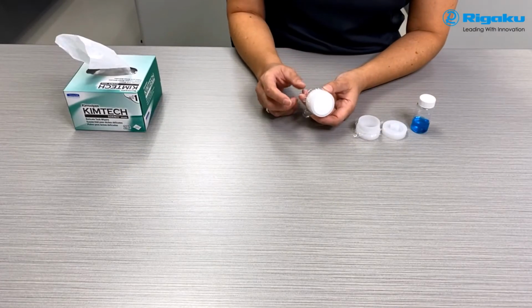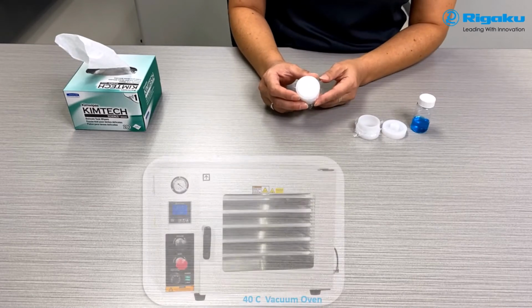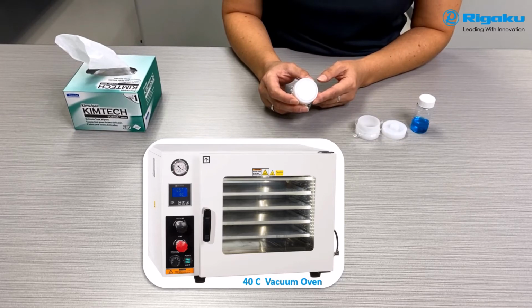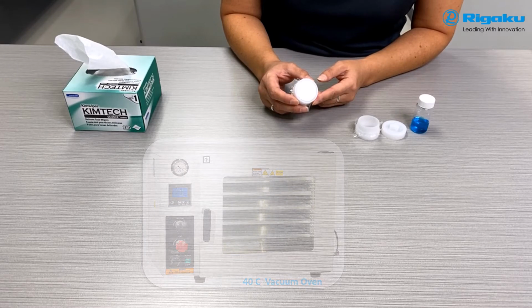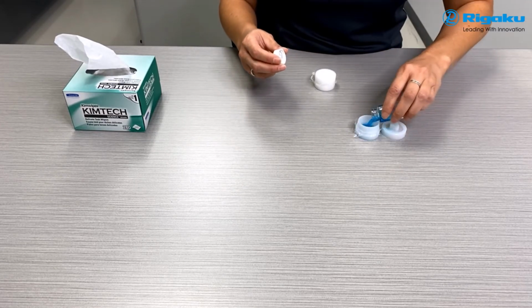Okay, so once you've determined the choice of film that you want to use, we recommend that you test it offline first before you expose it to X-rays. For a powder sample, I like to put it in a vacuum oven at say 40 degrees C. Maybe there's something that's going to off gas from the sample. I'm going to test that out first in a vacuum oven at about the temperature it's going to be on the machine. And if it's good there for 5 minutes, it's good to go for all the samples that are like that.